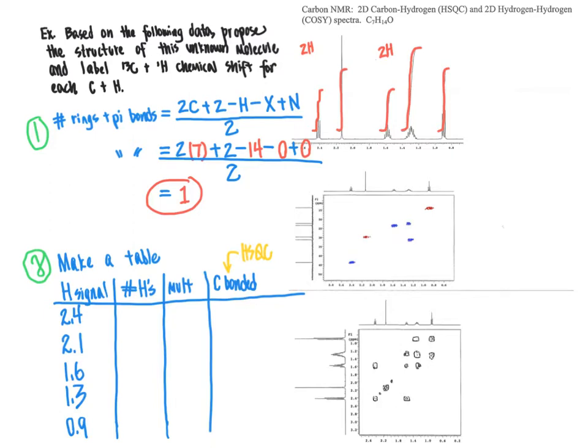this signal right here looks larger than that, so maybe we could call that 3 hydrogens. If this signal here is 2/3 the height of that, that would indicate this is 2 and this is 3. Back to 2, and we come to our most upfield signal here. I would say that we could also assign it as 3 hydrogens, because it is the same height as the signal over here. So it'd be 3, 6, and then 2 plus 2 makes 10 total. And that would mean that this signal here would have to, by process of elimination, represent 4 hydrogens.